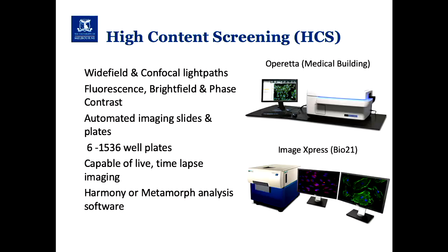the system. So we can basically say, image these channels, image these wells, do it every 20 minutes, and tell the system to go off and do that automatically for us. So again, it's not massive resolution, so we're not looking really at high resolution information. We can get subcellular information, but it's a little bit limited. But it allows that kind of automation in the experiments that you're setting up.